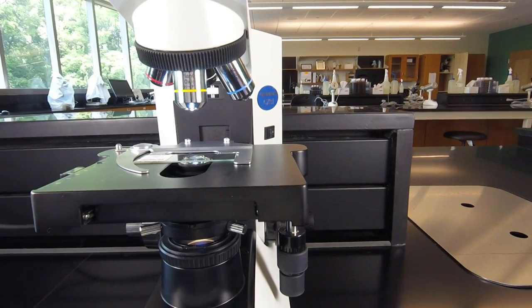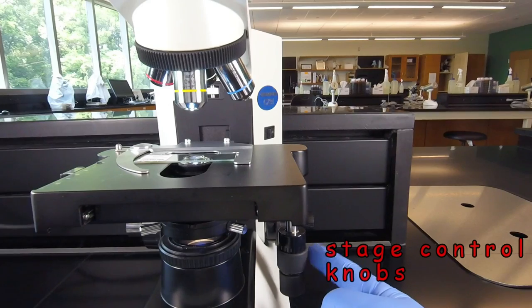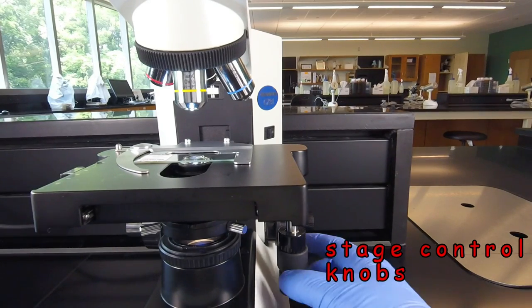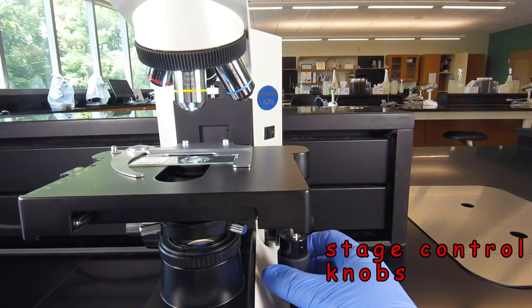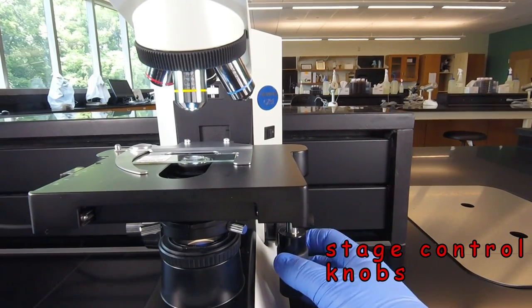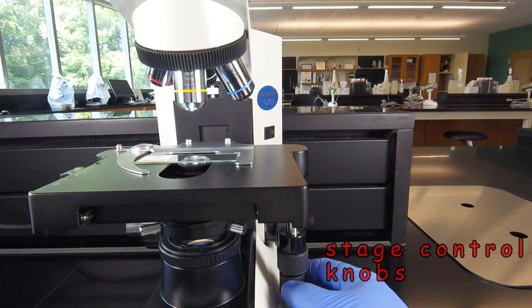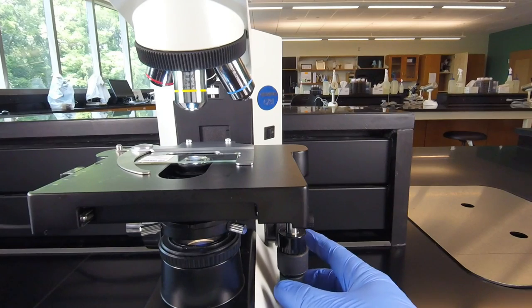Now we're going to use the two knobs that control positioning the slide. Notice if you take the top knob, the one on top here, and you turn that, the slide holder and the stage goes forwards and backwards. And when you turn the bottom one, the slide holder goes left and right. So we can use that to kind of center the slide.